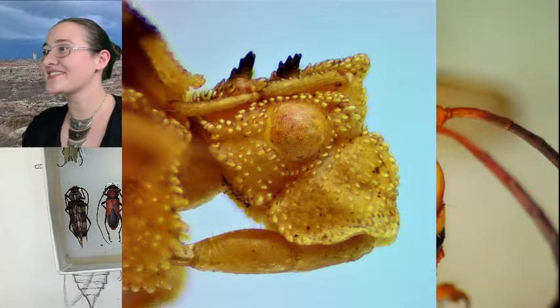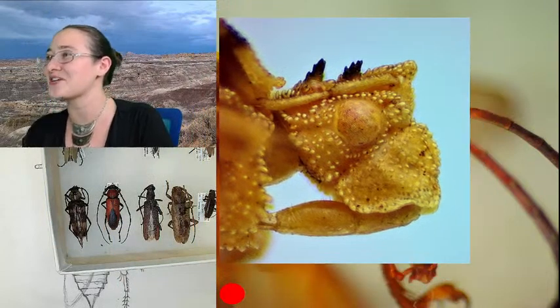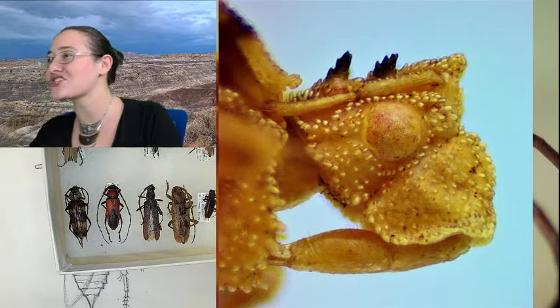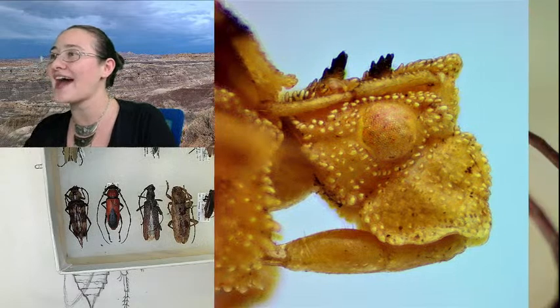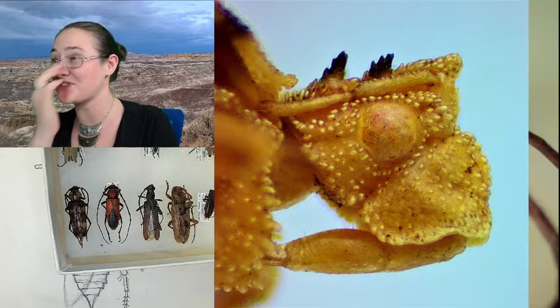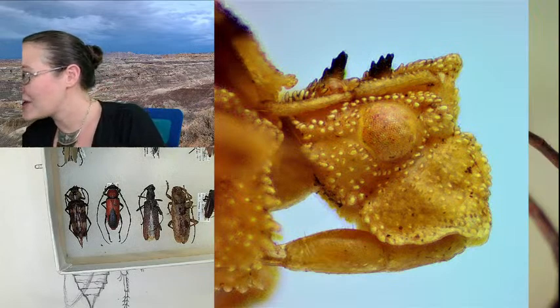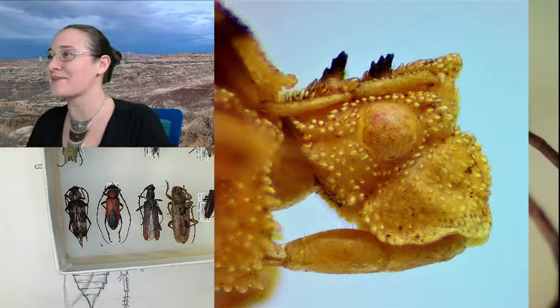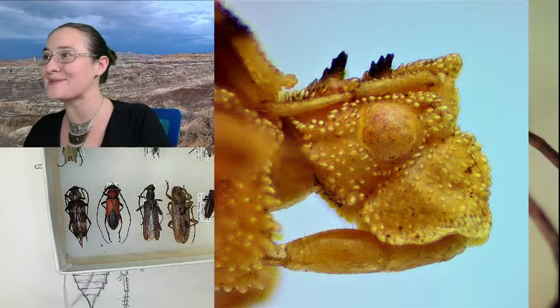So this is another insect, the head of an insect that I was considering sketching with you guys. It's called an ambush bug. And so it's actually in the subfamily Phymatinae, as an assassin bug. It's a reduviid. So I think that that is definitely going to be on the list for you guys to sketch. I love that. This is just a microscope image that I took of my specimen.